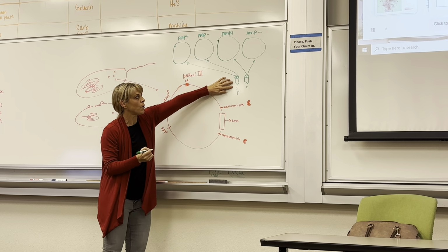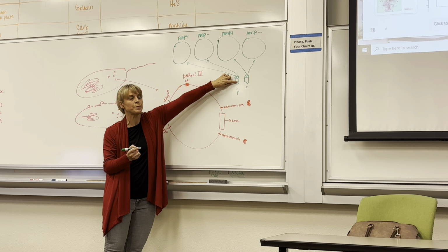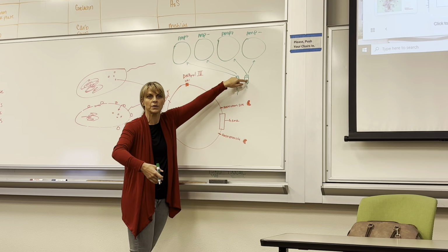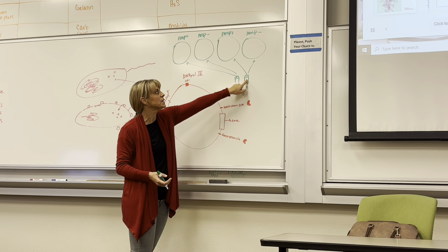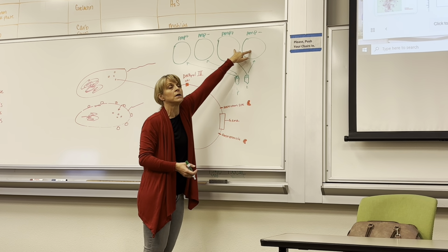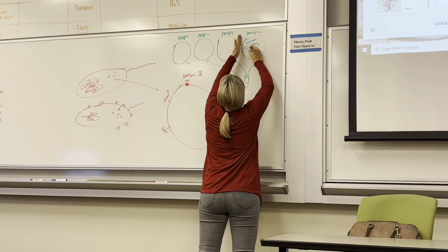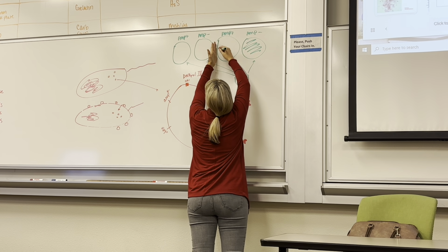So here was E. coli in this little Eppendorf tube. Everybody stay with me. We had E. coli in this tube, and we put our plasmid in this tube. We put just E. coli in this tube, plus broth, plus CaCl2, whatever else we added to this one. But we did not put the plasmid in here. So if it's just E. coli, it's going to grow. Would it grow with no antibiotics? Yes. If it's just E. coli, will it grow with antibiotics? No, nothing.